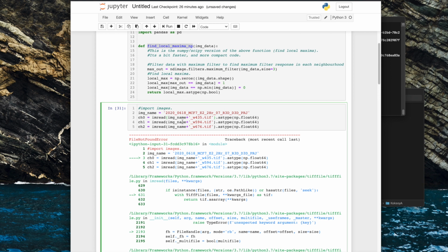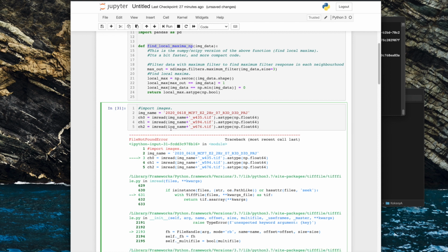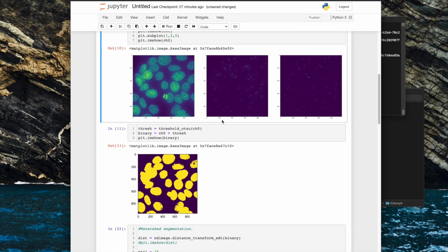So I forgot to add in the directory when I took that out. Like so.